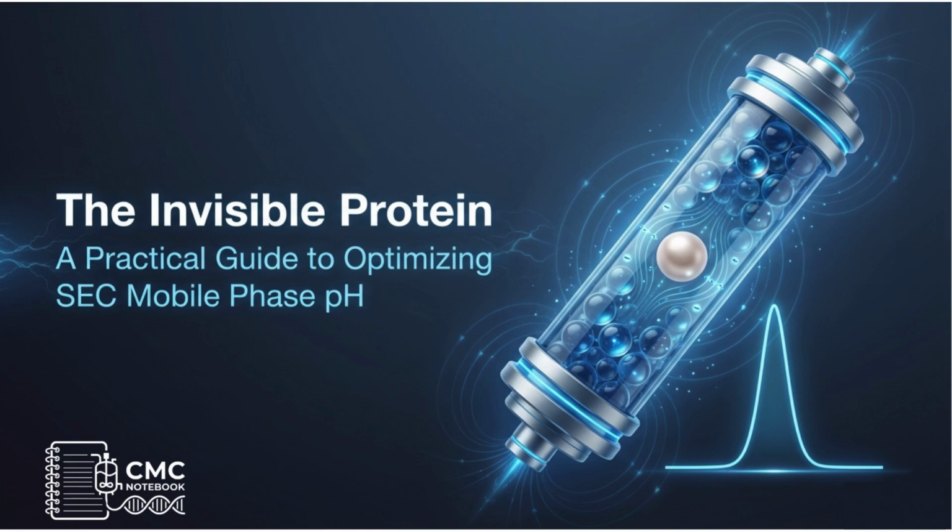Choosing the right mobile phase pH is one of the most critical steps in SEC method development. We call it the invisible protein because in a perfect SEC run, the protein should pass through the column without the chemical surface ever seeing it. Next, we'll explore how to use pH to achieve this perfect size-only separation.